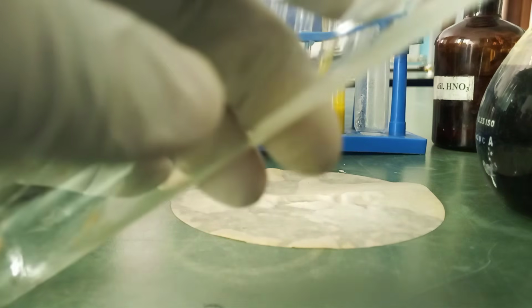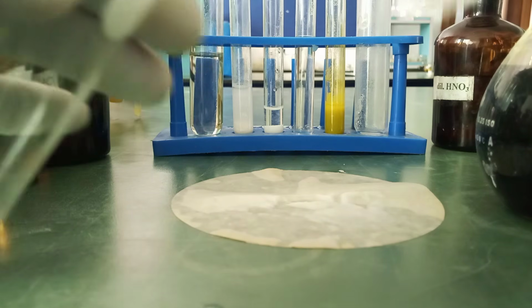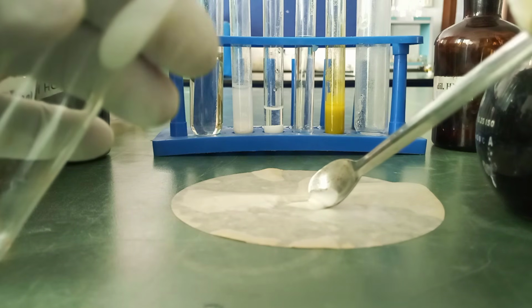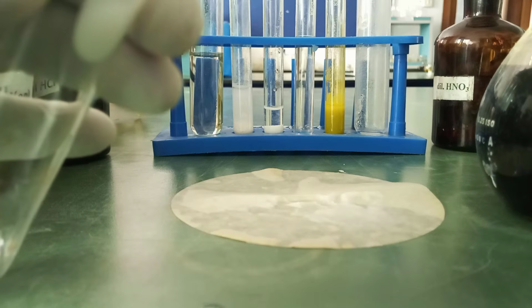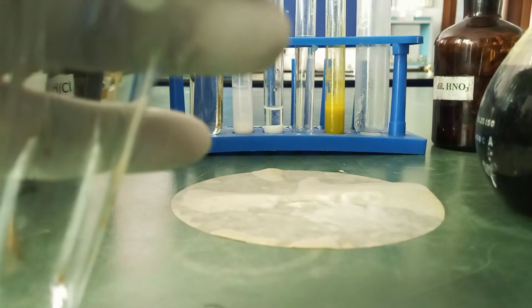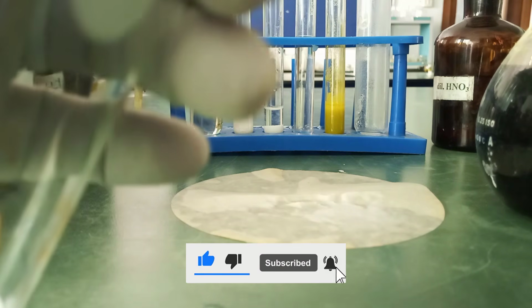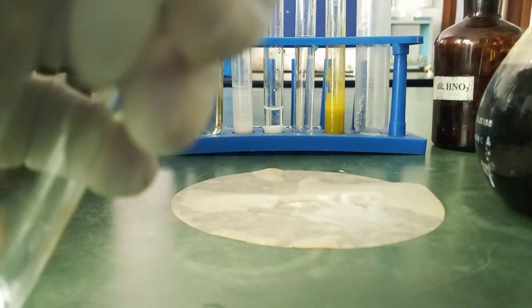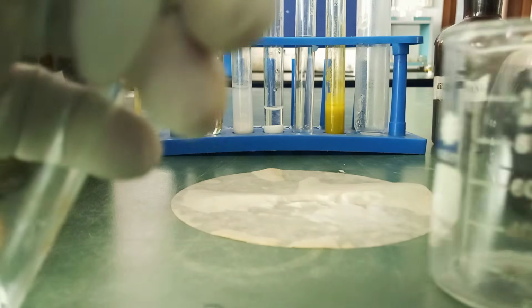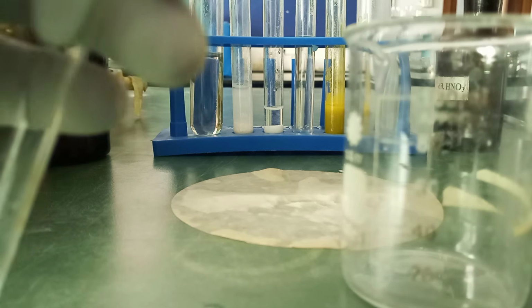Okay, so because of this jelly-like nature, it's making it difficult to be added to the test tube, or boiling tube. That's not a problem. I have the little quantity that I need. So I'm going to take a little portion of the iodine solution.